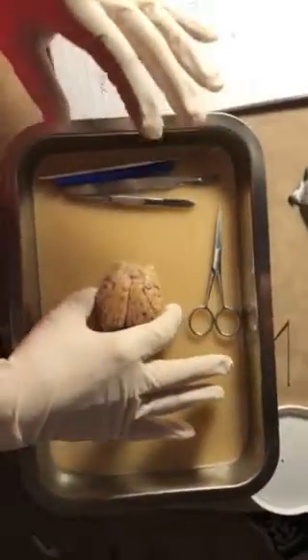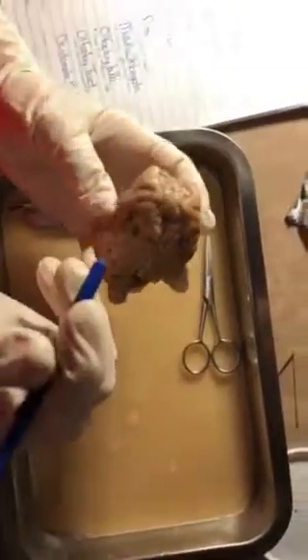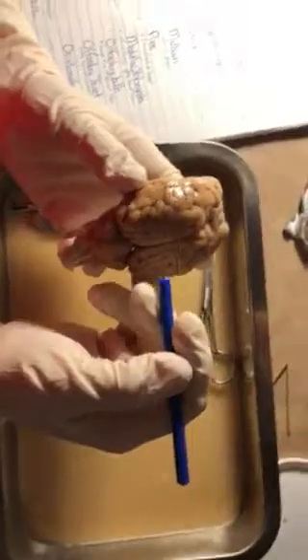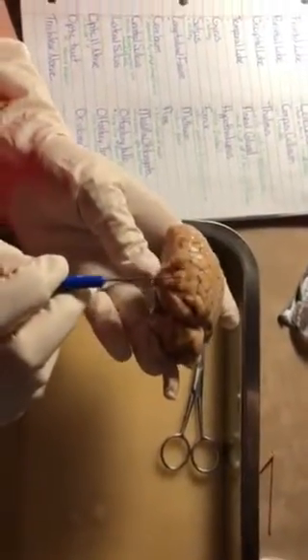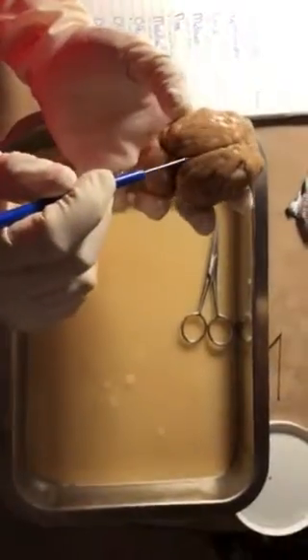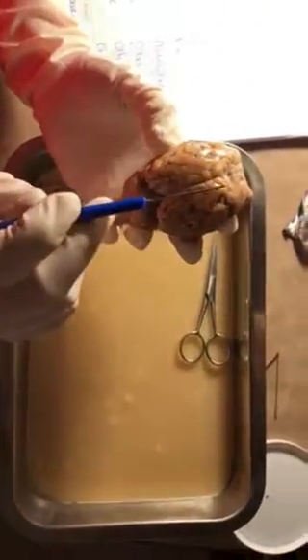And I'm going to point out some of the features on the outside of the brain first before I actually make a cut into the brain. So up front here, we're going to have the frontal lobe. Over here is the parietal lobe. On this side, we have the temporal lobe. And in the back here, we have the occipital lobe. The longitudinal fissure here separates the cerebrum.